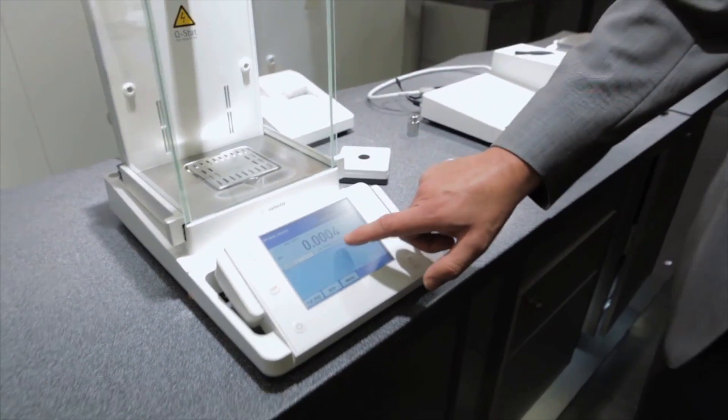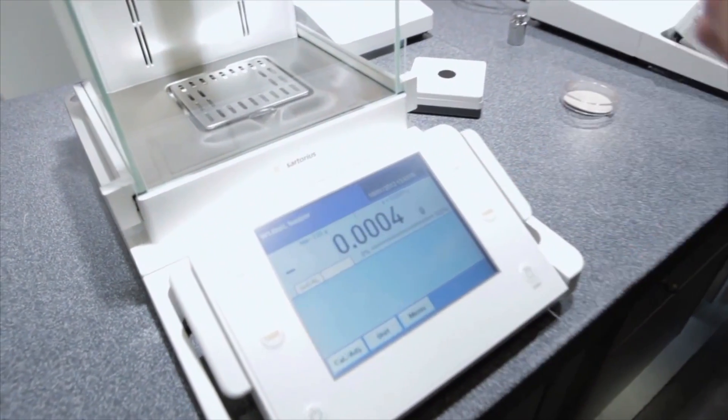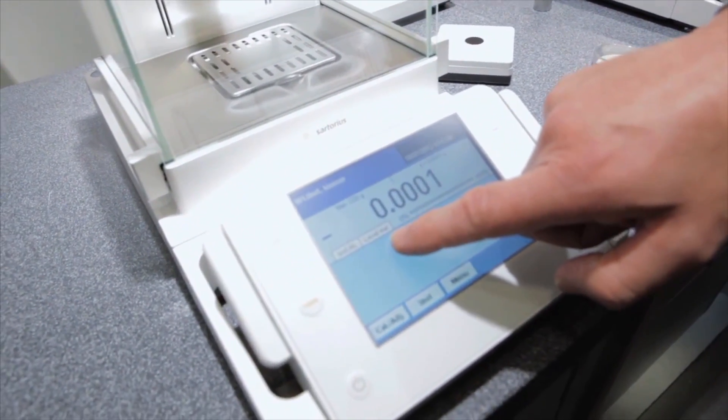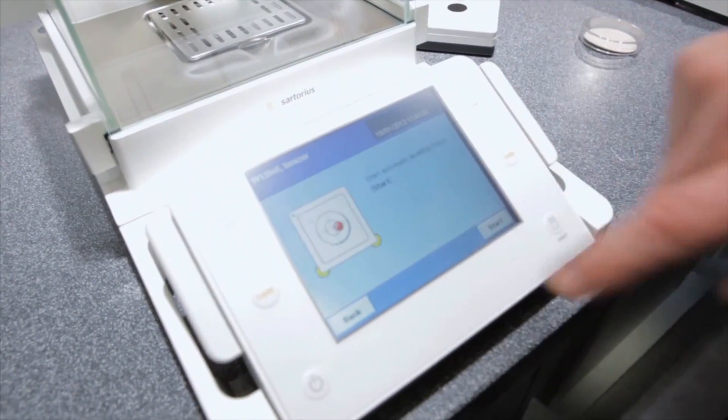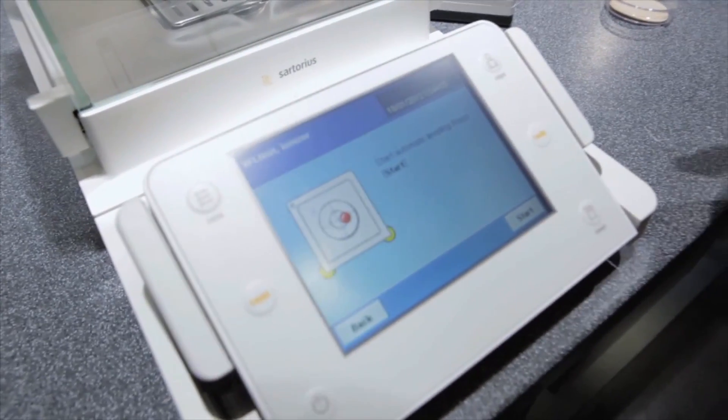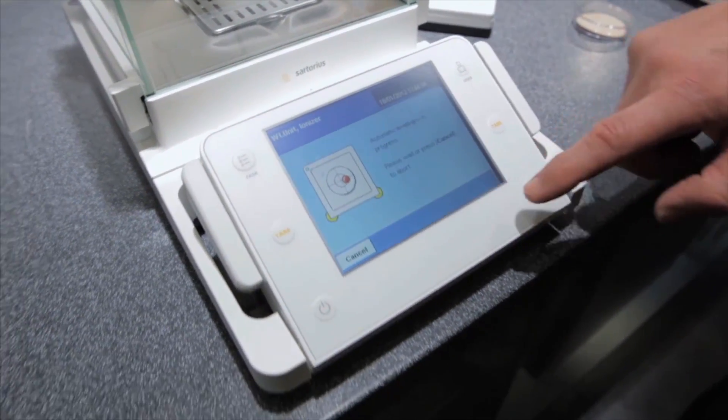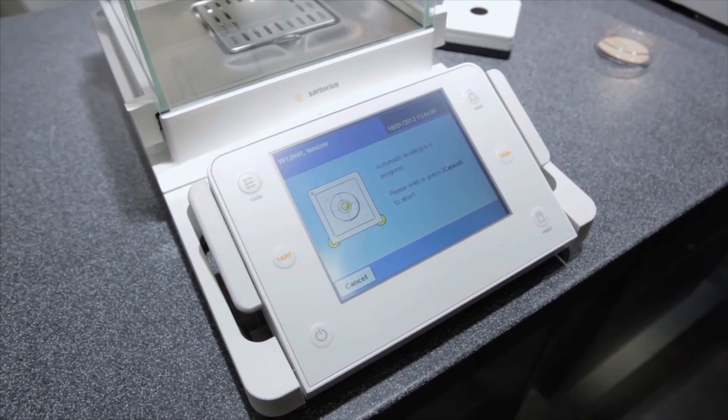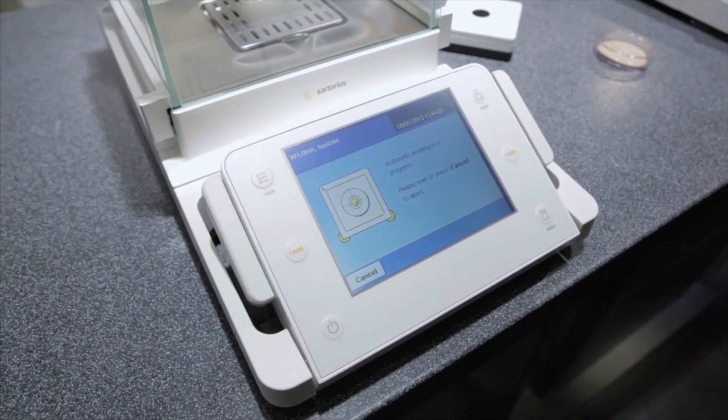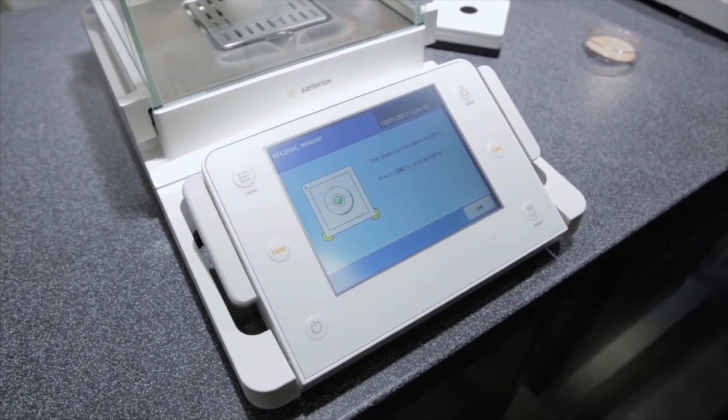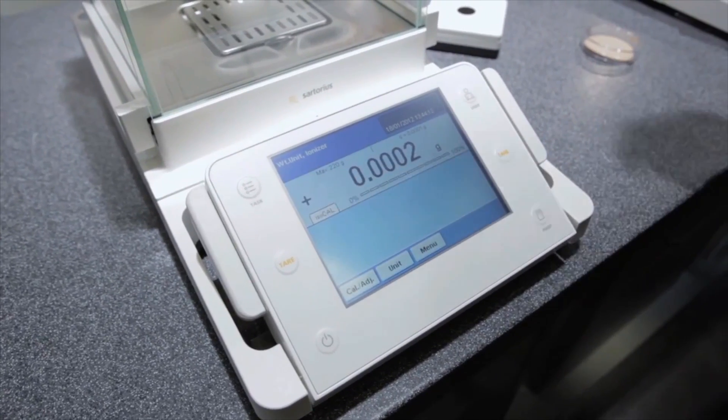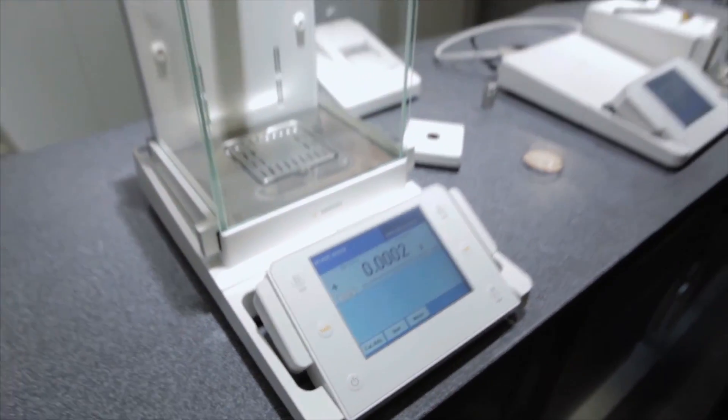Here we have the possibility as well to be sure that we're working accurately. The balance is saying it should be level. All I have to do now is to push the key and with the option of automatic leveling press start and the electronic bubble is automatically adjusted to bring the balance back into level. This ensures that the weighing is accurate and at all times giving the right result that you should have.